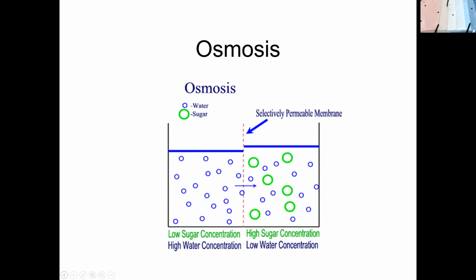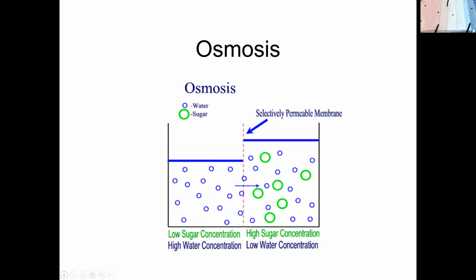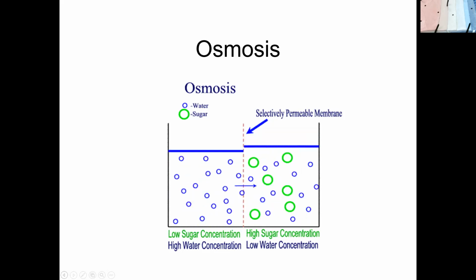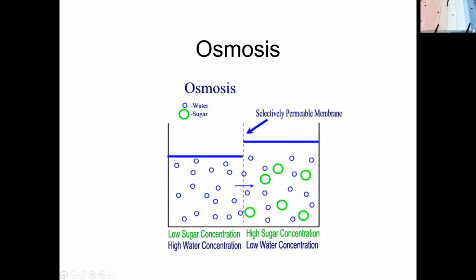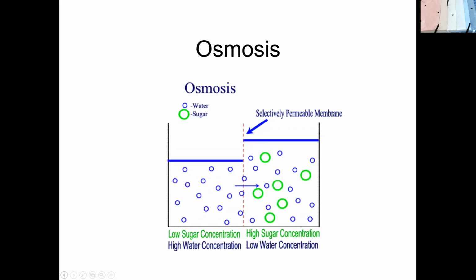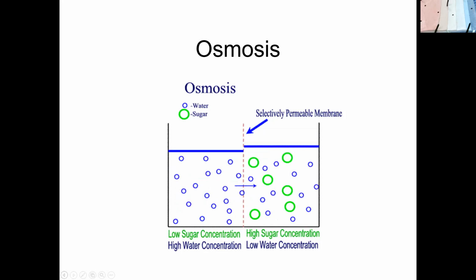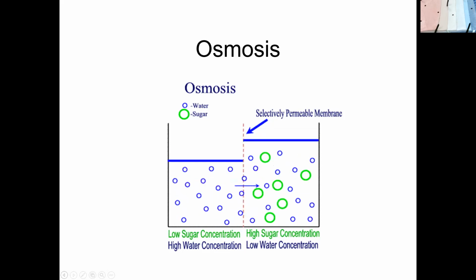How do we know? Well, I weighed the artificial cell before we started. The weight of the cell with the salt water was 30.39 grams. In the salt water, the 10% salt or 90% water, I put an artificial cell that was 100% distilled water.